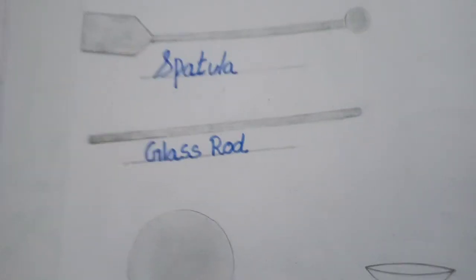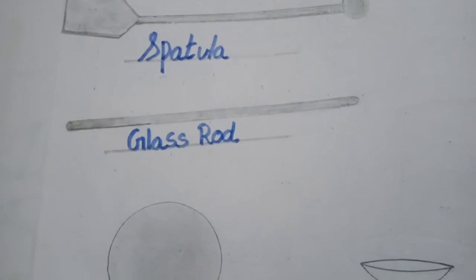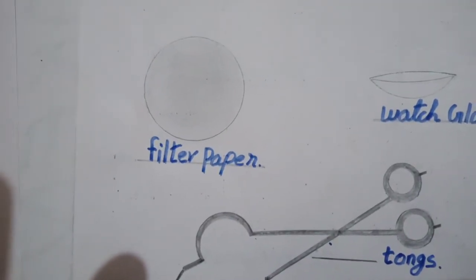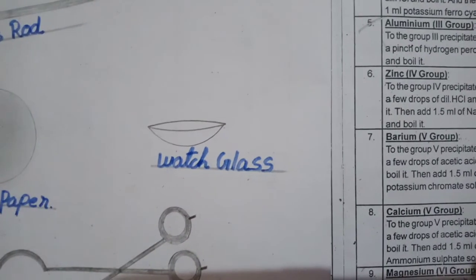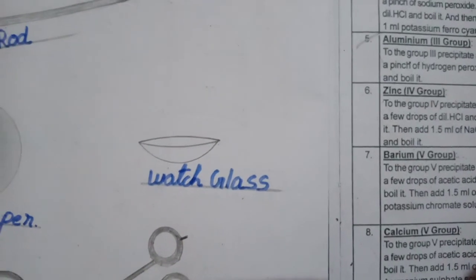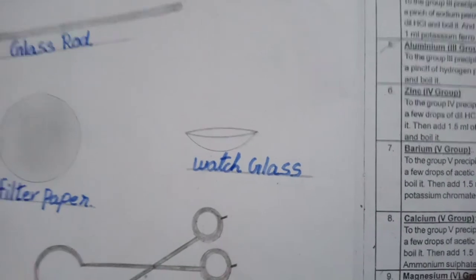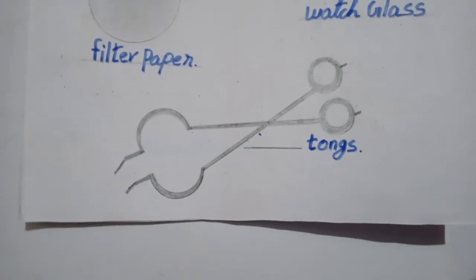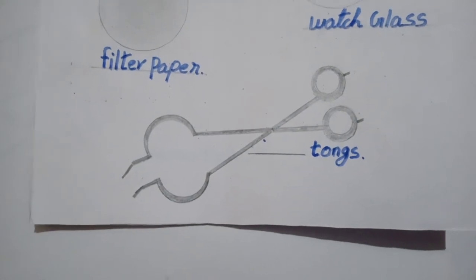Filter paper is used with a funnel to filtrate chemical mixtures. Next one is a watch glass. The watch glass is used to place some salt and take it out of the test tube. Next one is tongs. Tongs are basically used as a boiling tube holder.